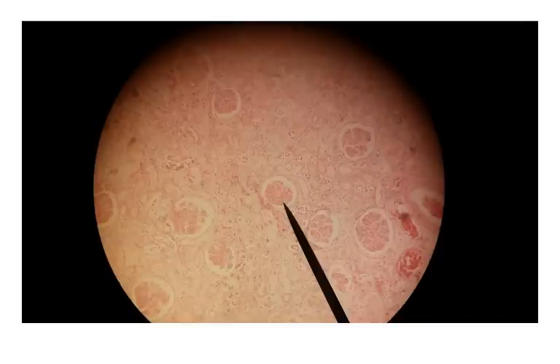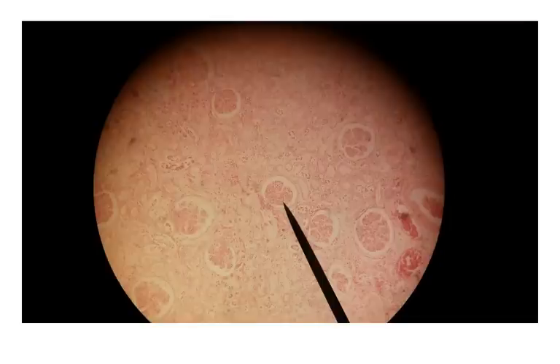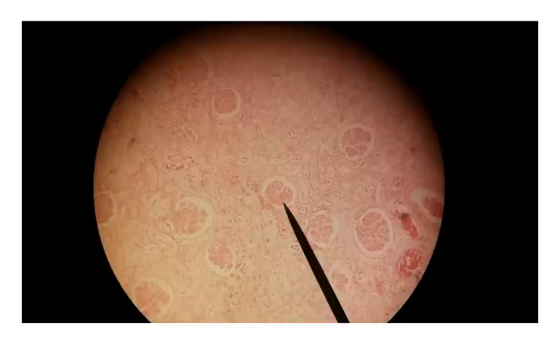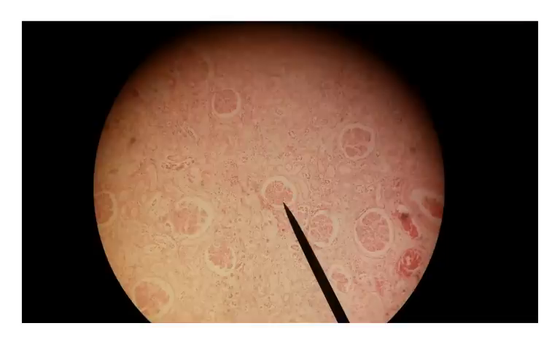This open area around the glomerulus catches the liquid being produced — called filtrate — and this shell is called Bowman's capsule. The glomerulus and Bowman's capsule together make something called a renal corpuscle. This area on this slide contains both renal corpuscles and kidney tubules. Keep that in mind as we go to the next slide to see a difference.